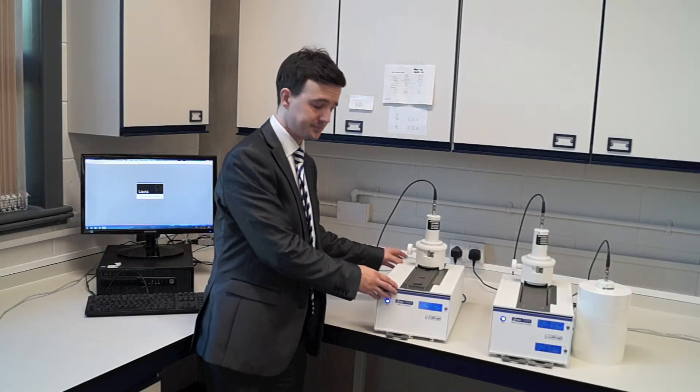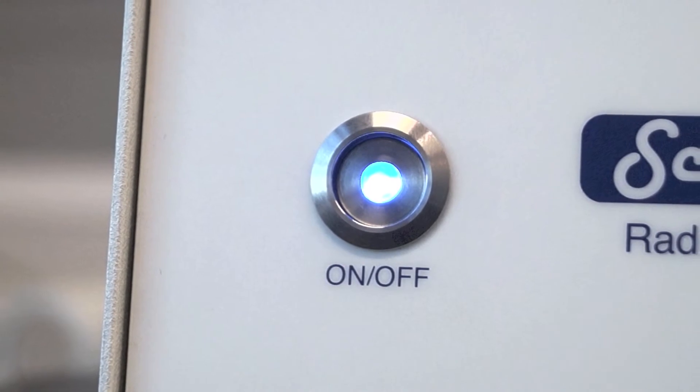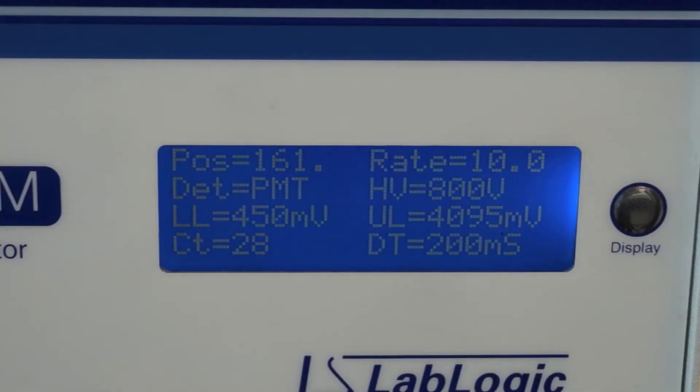You can see the system looks very simple — it's a very compact design. On the front end we have an on-off power button and a heads-up display. On the display it shows the run parameters, but it's very important to note that you can't change anything to do with the run parameters from the hardware itself.